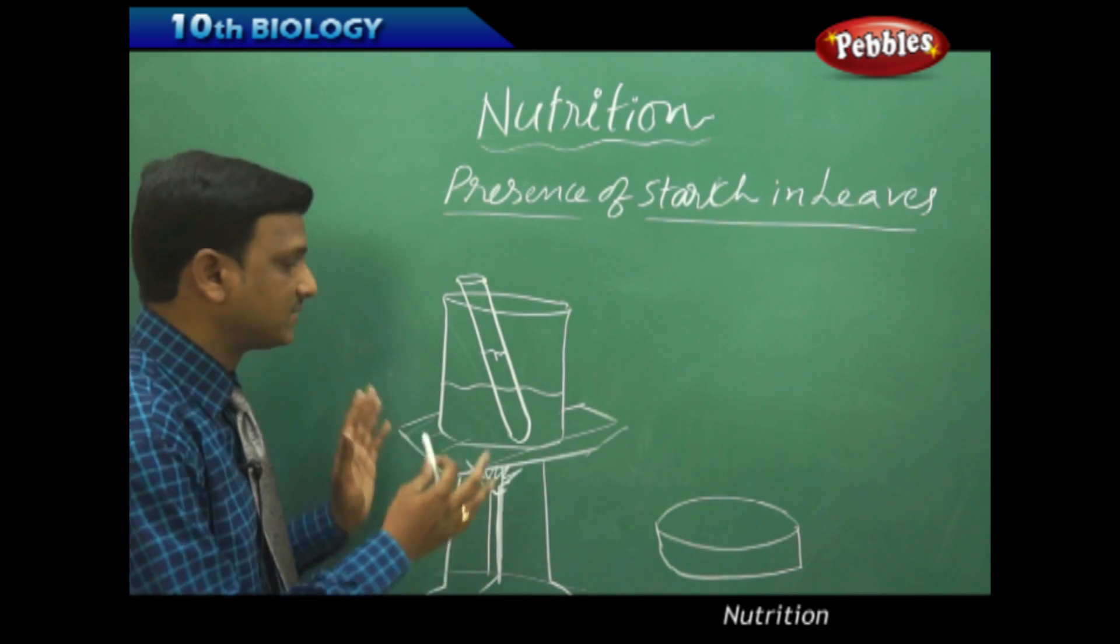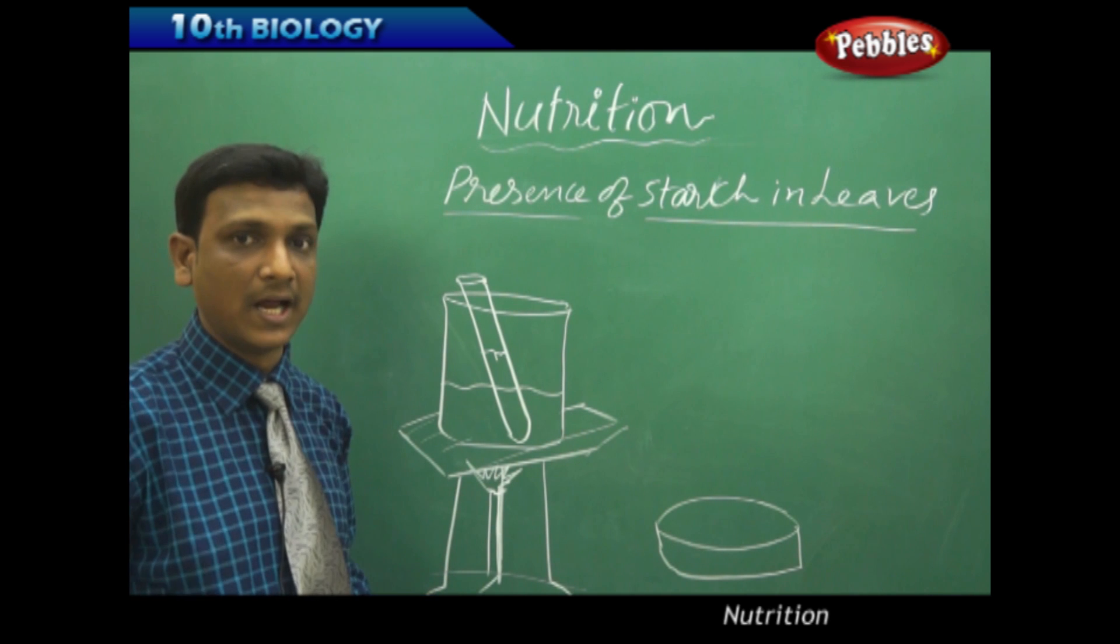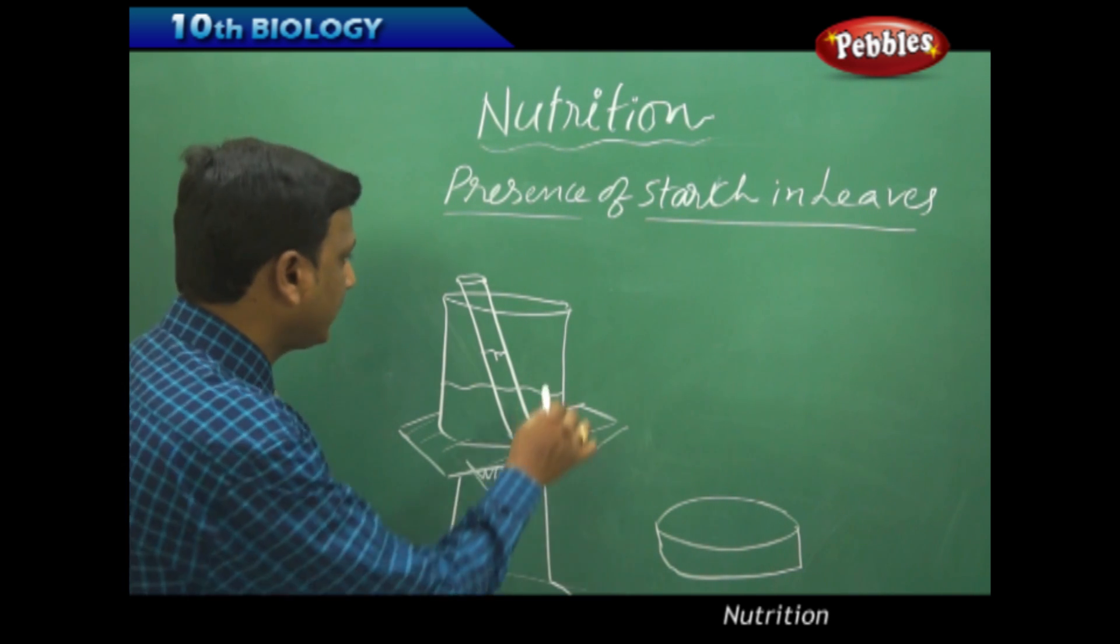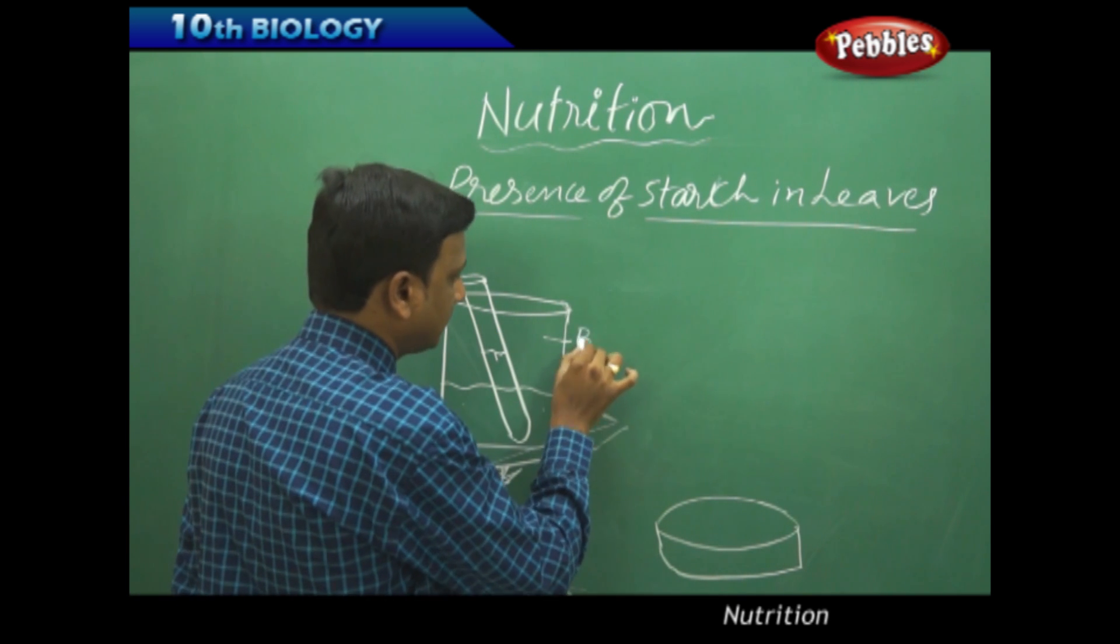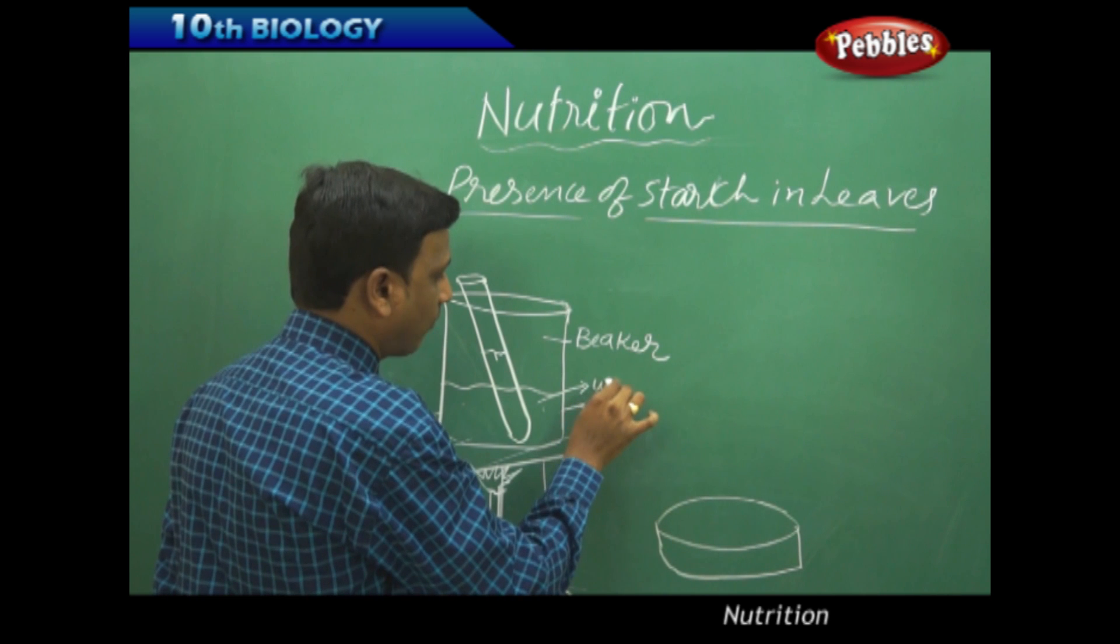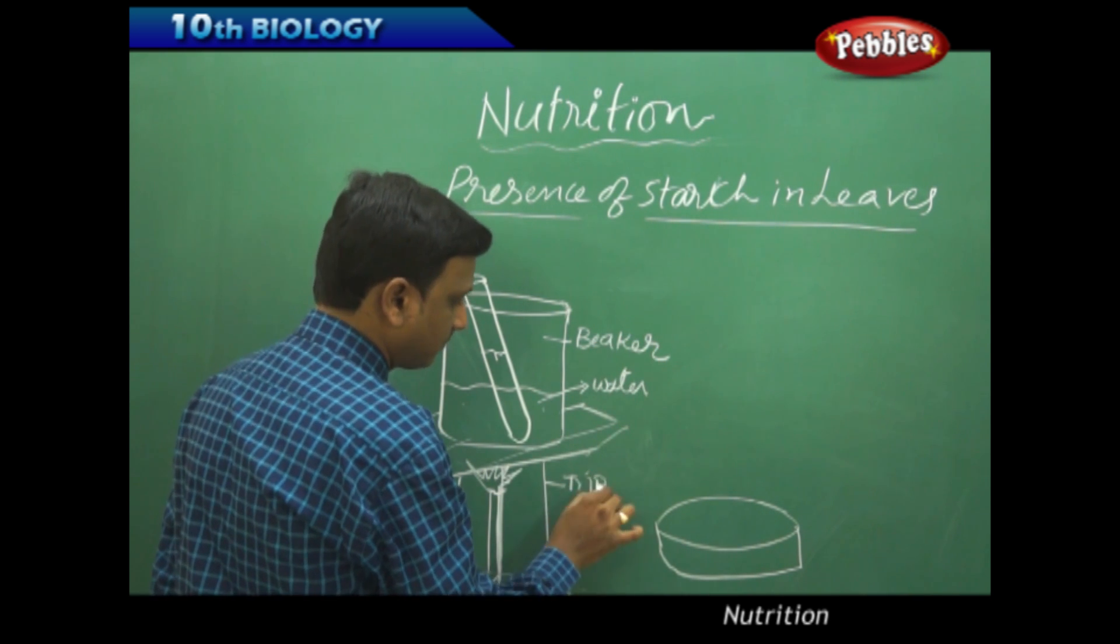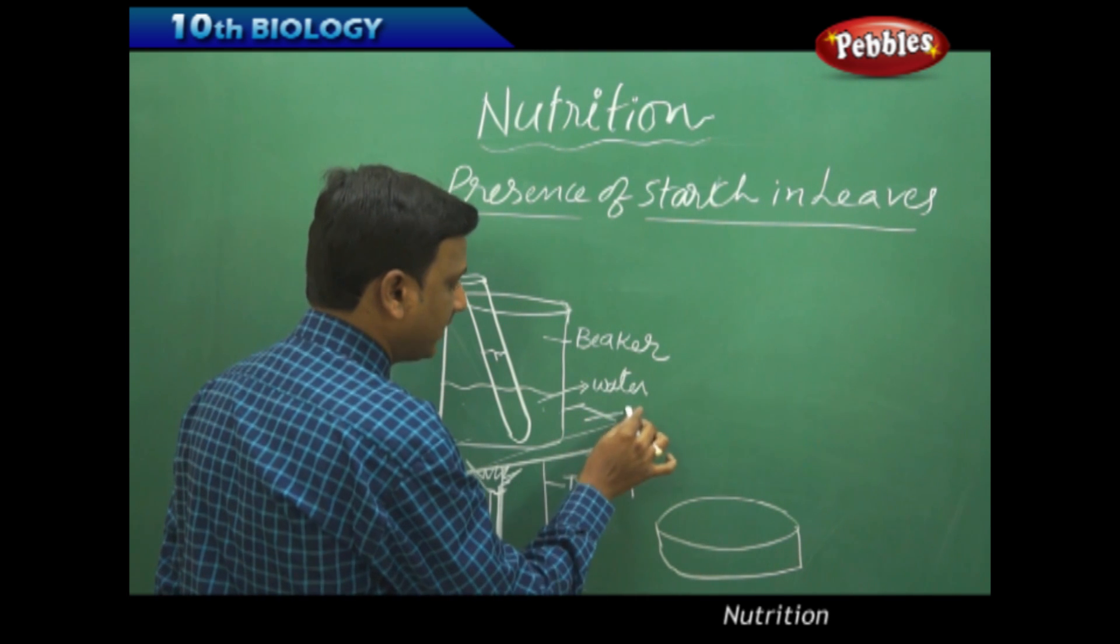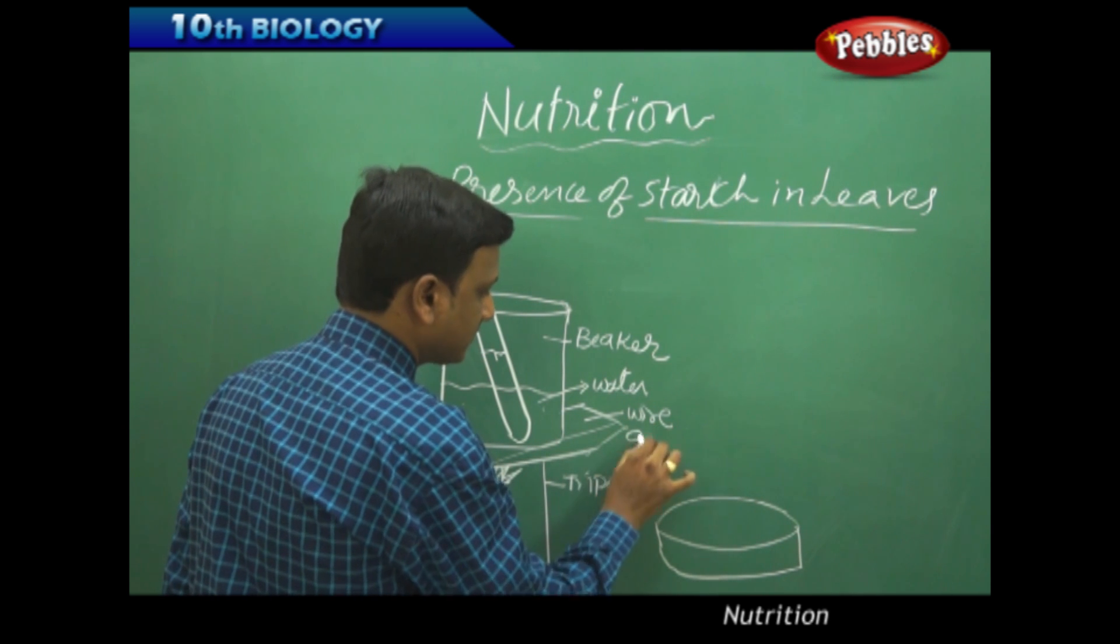Let us see, here we have some setup, some apparatus. Let us see what are these apparatus and how to do this activity. We need to have a beaker with water. So this is a beaker with some water. And we need a tripod. And we need asbestos gauze, a wire gauze.